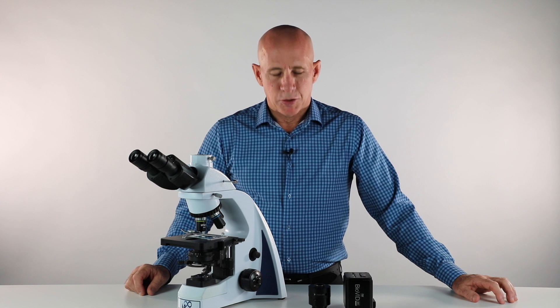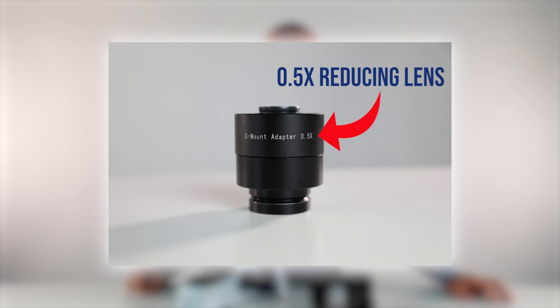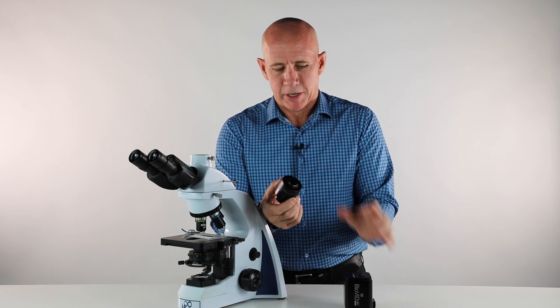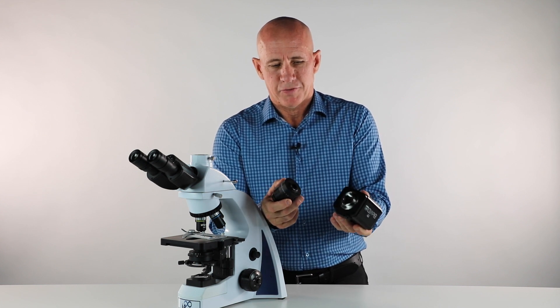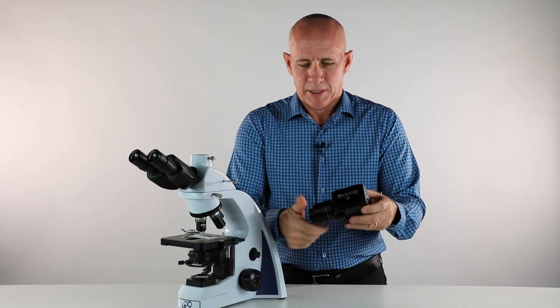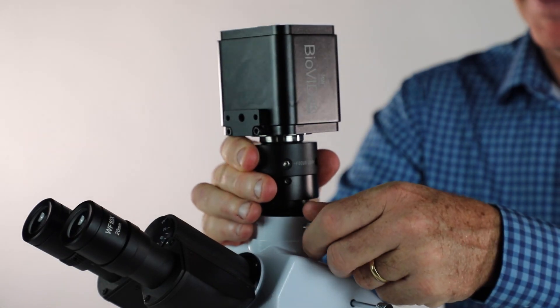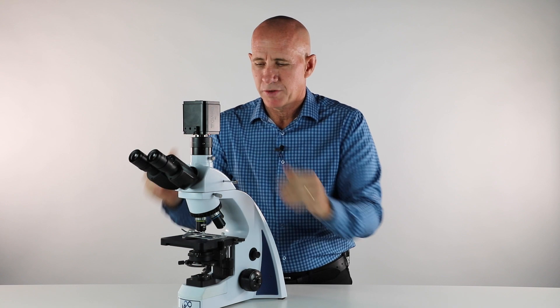Next, in the box you'll find your trinocular pipe — it's the black C-mount trinocular pipe that has a 0.5 focusable lens on the inside. The threading on top is called a C-mount threading, and all microscope cameras will have a C-mount threading on the face of the camera. That is how you mount the camera onto the trinocular pipe. Once threaded onto the pipe, it will drop right into the top of the microscope — tighten it up and make sure your camera is oriented straight towards the front.